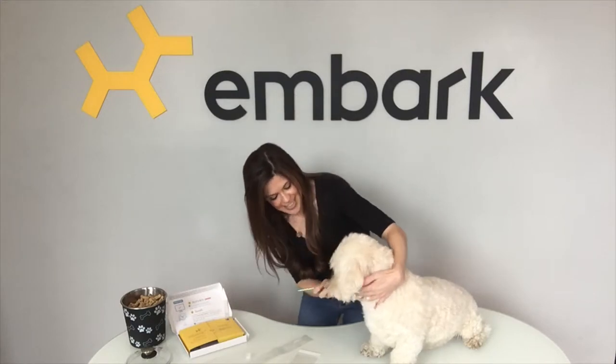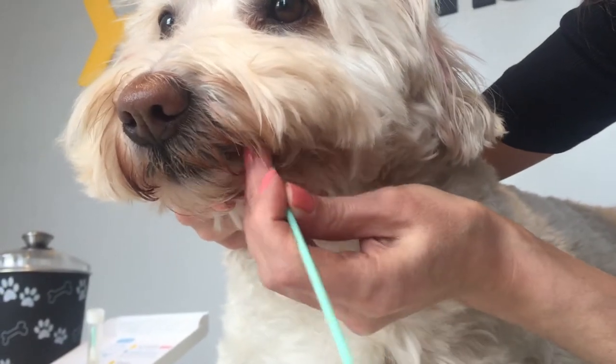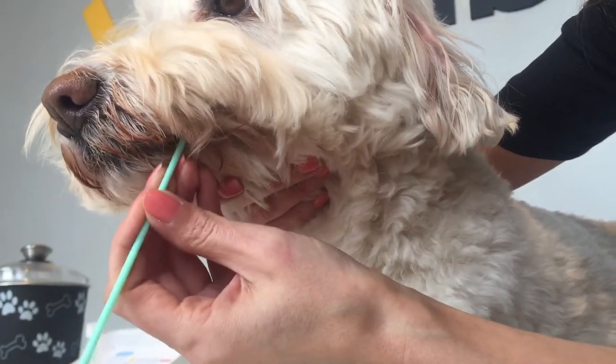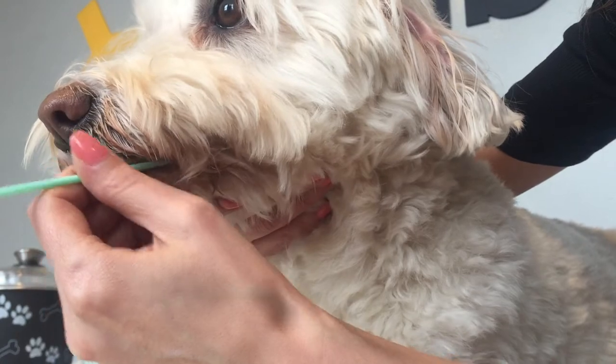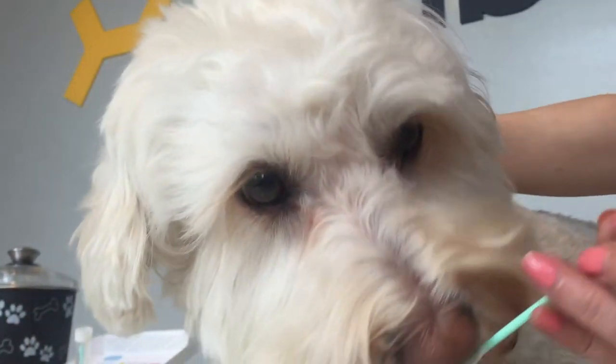Okay, the next step is to remove the swab from the plastic casing and place it into your dog's mouth starting with the lower cheek pouch. Can I just get in there buddy? You'll want to swipe the flat surface of the swab head gently up and down the inside of your dog's cheek for about 30 to 60 seconds. Keep in mind that it helps to flip the swab so that both sides come in contact with your dog's inner cheek.